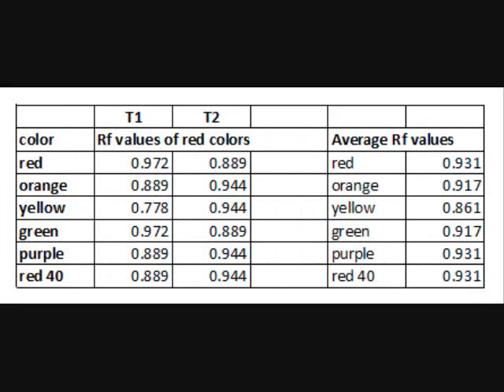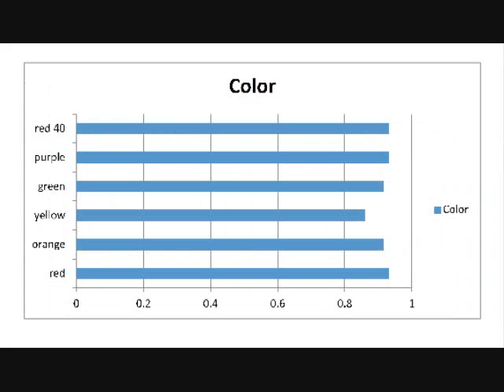In the lab, we found that all the colors had some red in them, and when we compared the average RF values to the average RF values of red 40, they were similar, if not identical. Thus, we decided that they all contained trace amounts of red 40.